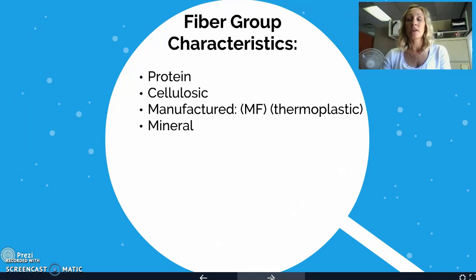If your fiber has a protein base, you're going to notice that the fiber curls away from the flame. The fiber will support combustion with some difficulty. It will kind of sputter on and off as you're burning, so watch that. When you remove a protein away from a flame, it will self-extinguish.